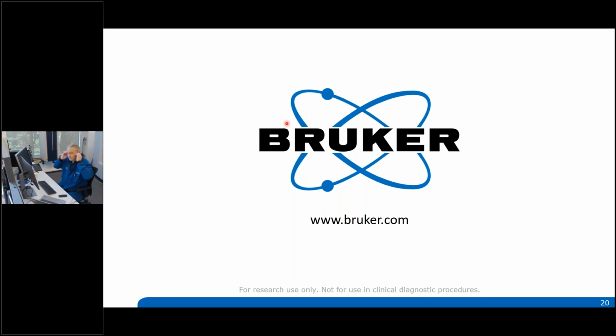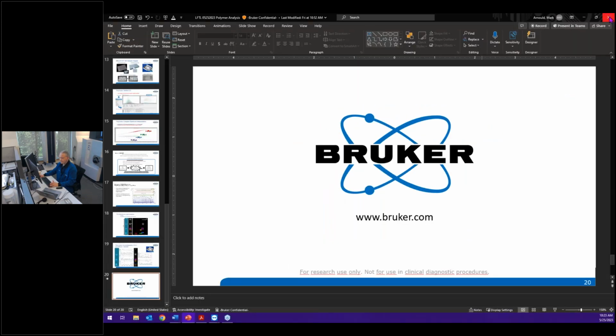Okay, so getting the target in this particular instrument is quite easy. It's automated. So you just put the target onto that tray, the tray takes it in.